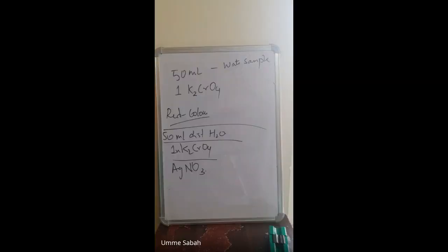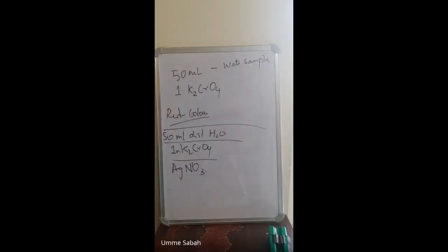Ma'am, will it turn red in distilled water? Not the red color, you know, but the concentration here will be less. Ma'am, in this also, in the conical flask, are we adding 10 ml NaCl? No, right? We are not adding. In the flask, it's only distilled water you are adding. Since the distilled water is deionized water, the requirement of AgNO3 will be less. The coloration also depends. First one will be dark red color because you have NaCl and AgNO3 there. And here, the moment you see appearance of color, you have to stop your burette.